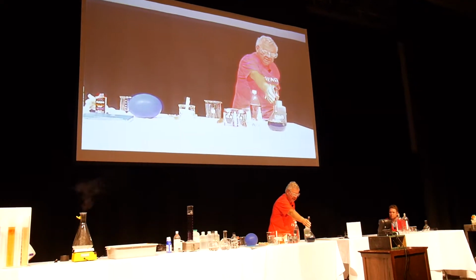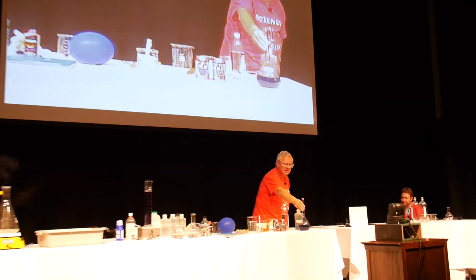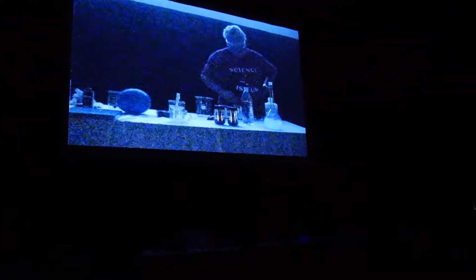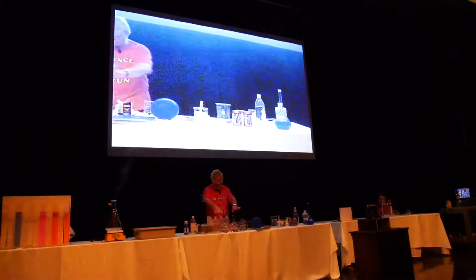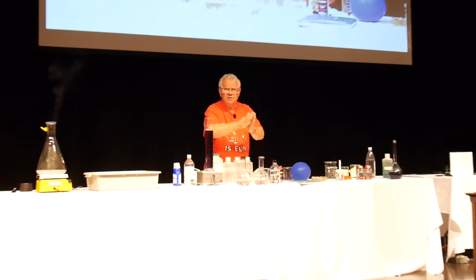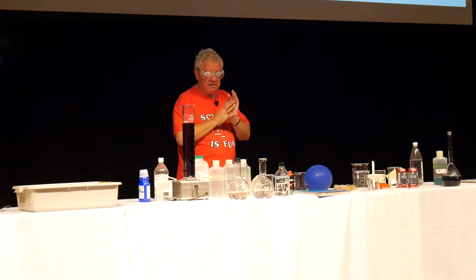You notice that the color has changed? And let's turn the lights down to see if it's still glowing in the dark. Not much, it's not glowing at all. Oh, well, just faintly that I can see it here. All right, we come back here with the lights up. How about our two flasks over here? You see the colors have faded. So color changes tell us that chemical reactions have taken place.